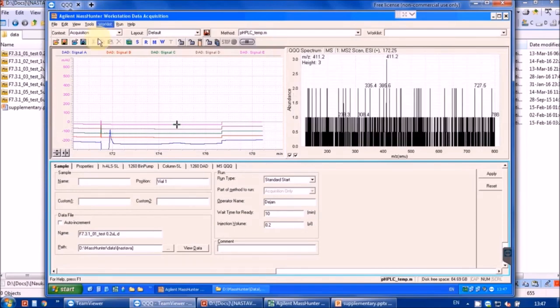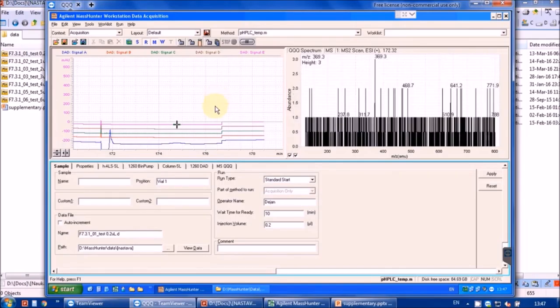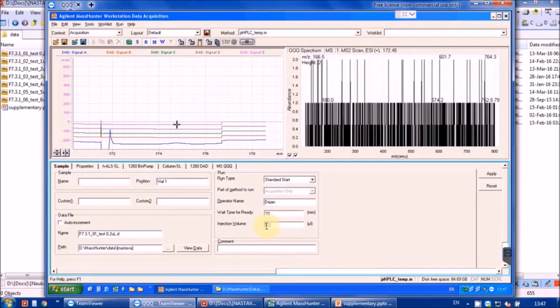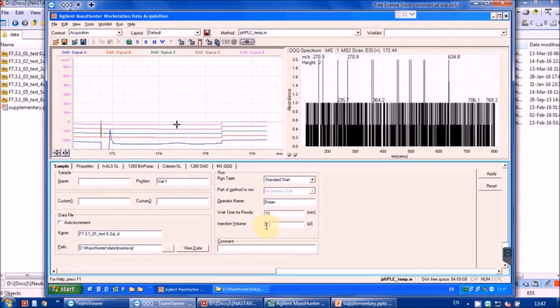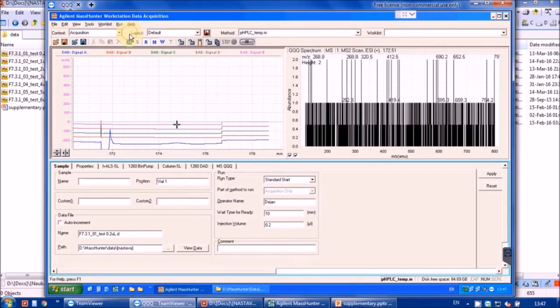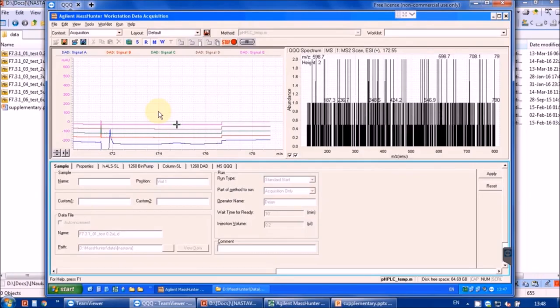After instrument equilibration, a very small amount of the sample, for example 0.2 microliters of 500 milligrams per milliliter solution, that is about 100 micrograms, is injected. If only a small amount is available, for example less than 1 milligram, the entire effluent can be collected, evaporated, and reused, which is labor intensive but sometimes necessary. In our case, we can afford to spend about 100 micrograms.